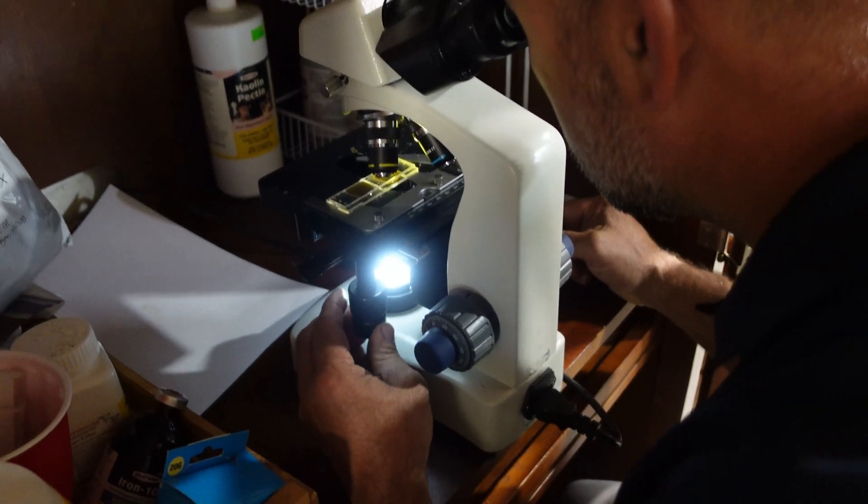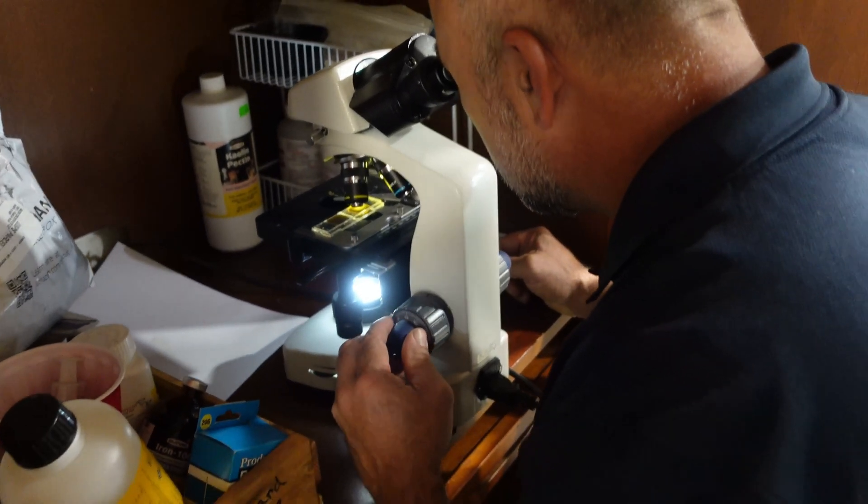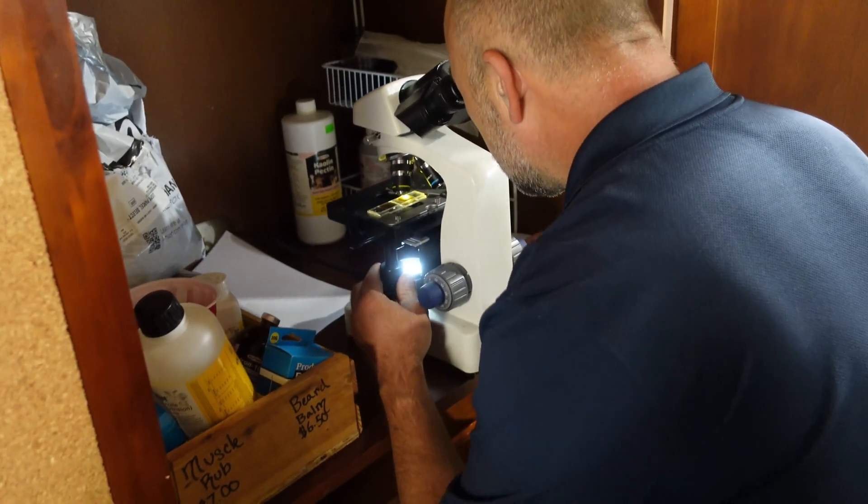In raising goats, the single most important thing is parasite control, and the best technique and tool we have is to do our own fecal samples and fecal tests. I'm going to demonstrate the modified McMaster's fecal egg counting technique, which I got from the North Carolina State Extension Service.